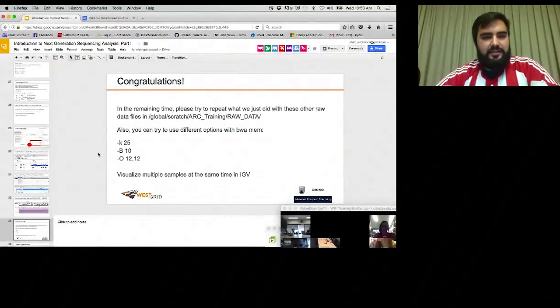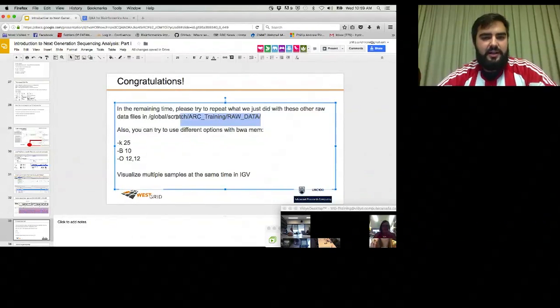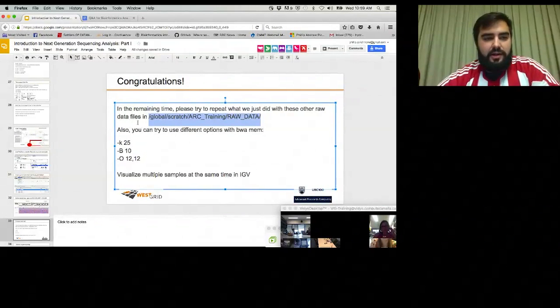So other than that, that is the end of our course right here at 11 o'clock. In the remaining time, I have other raw data files that you can process and analyze. They just represent different individuals that have been sequenced as a part of the 1,000 Genomes project.